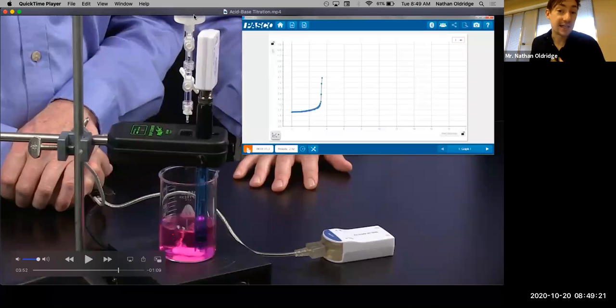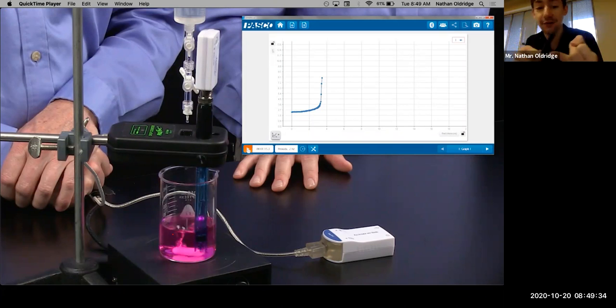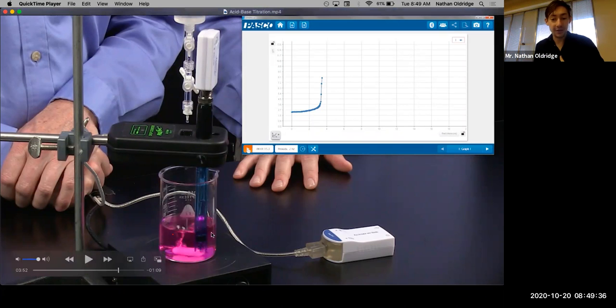That's when you take a look at how many milliliters of stuff you've used up, and if you know the concentration of it and you know the volume of the stuff that you added, that tells you the number of moles, in this case of base. And then if you know the volume of acid you used here, you can know the concentration of the original solution.